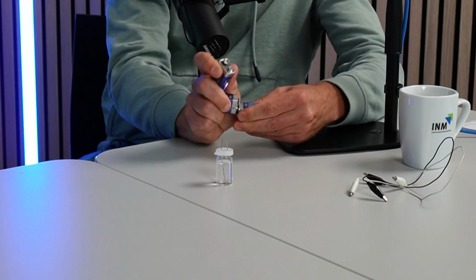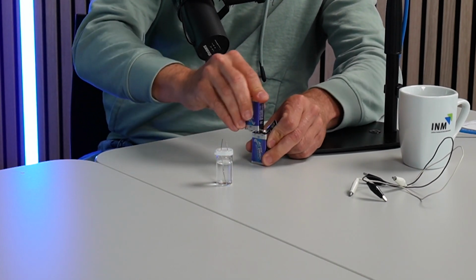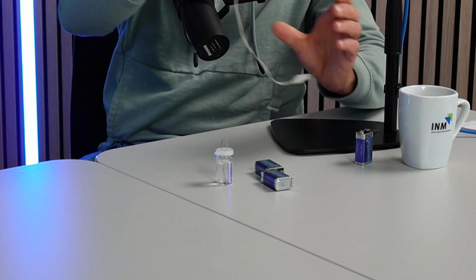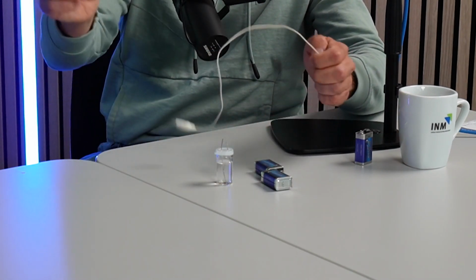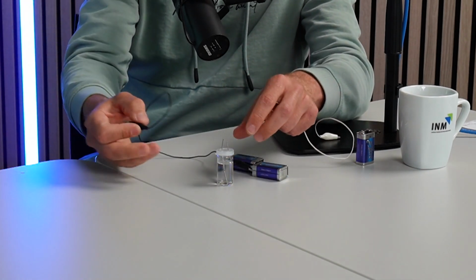Then we can take this nice 9 volts and create 27 volts if we plug them together, so we have more power to do the preparation of silver. No, it does not fit together. Maybe we have to do it differently. No, this does not work. Then we take 18 volts. And then I will explain why this starts and hopefully everything works.